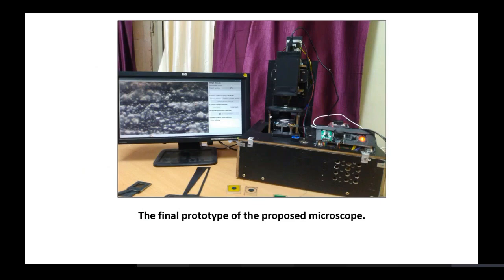Now this is the microscope which has been developed. If you see, there are these joysticks which are basically the control system. Then you have a condenser over here. Since everything is black, it is not visible, and at the bottom you have the light source.